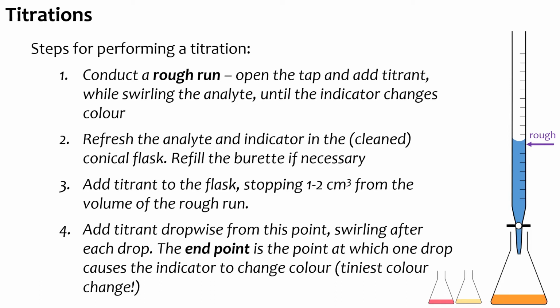And then add a drop, and we can see here that we have the tiniest difference in colour. It's not gone yellow, but it is no longer the red that it started off with. Okay, so that we would be looking at as the end point, but we are talking about single drops. It is a tiny amount, and we're going to look at why that is so important in this video.